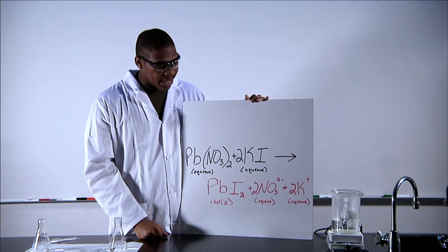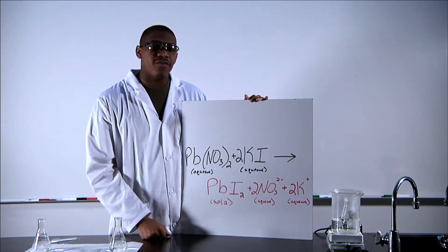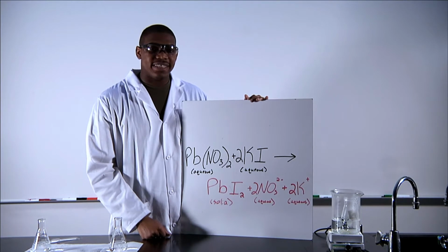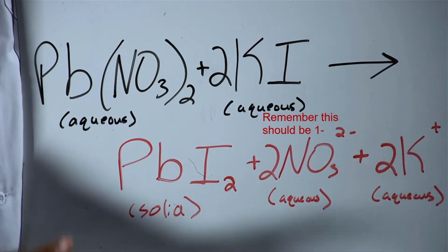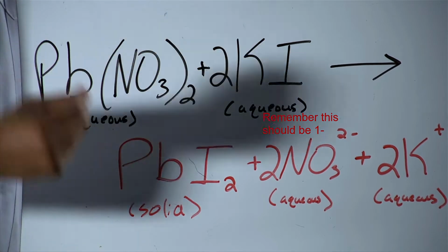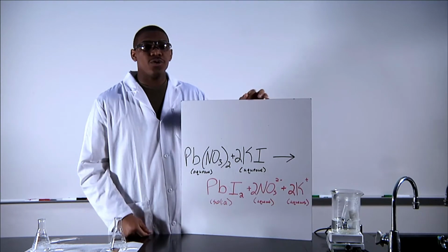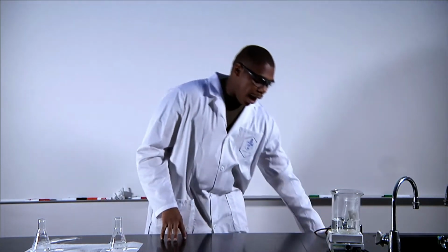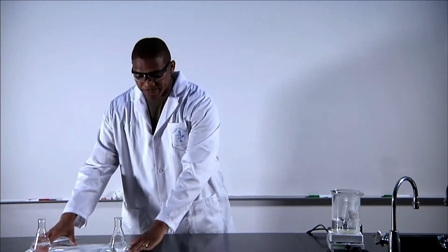So we're going to see that, and then we can play around with that concept, take it out of the dissolved solution, and see what happens with the lead iodide after the solution cools down. We would expect it to precipitate out again. So we're going to show you and help you observe what happens when we understand solubility rules and how it plays into these reactions.